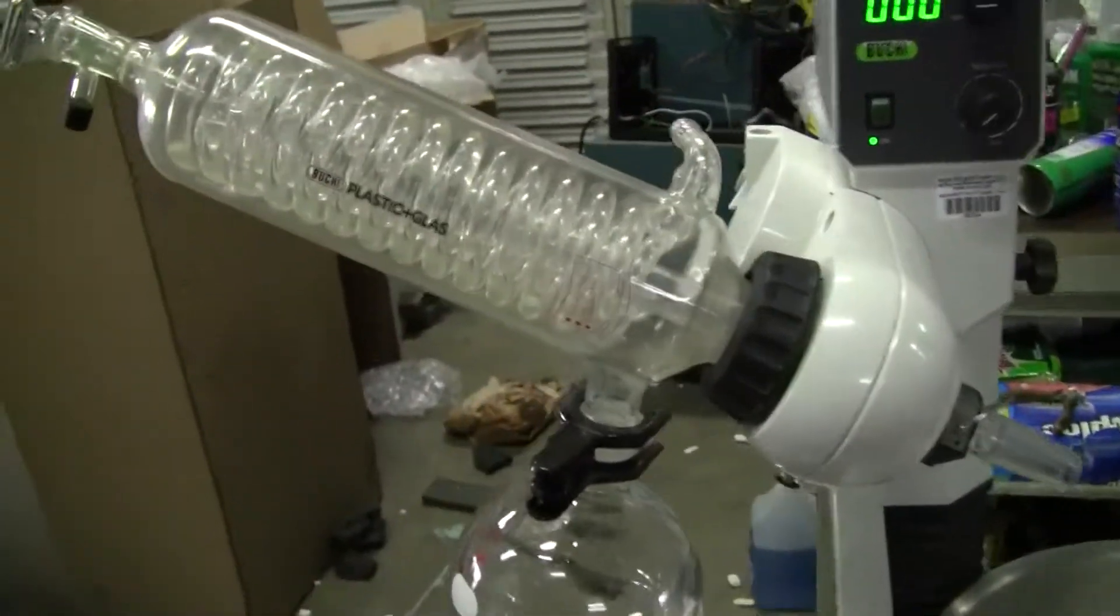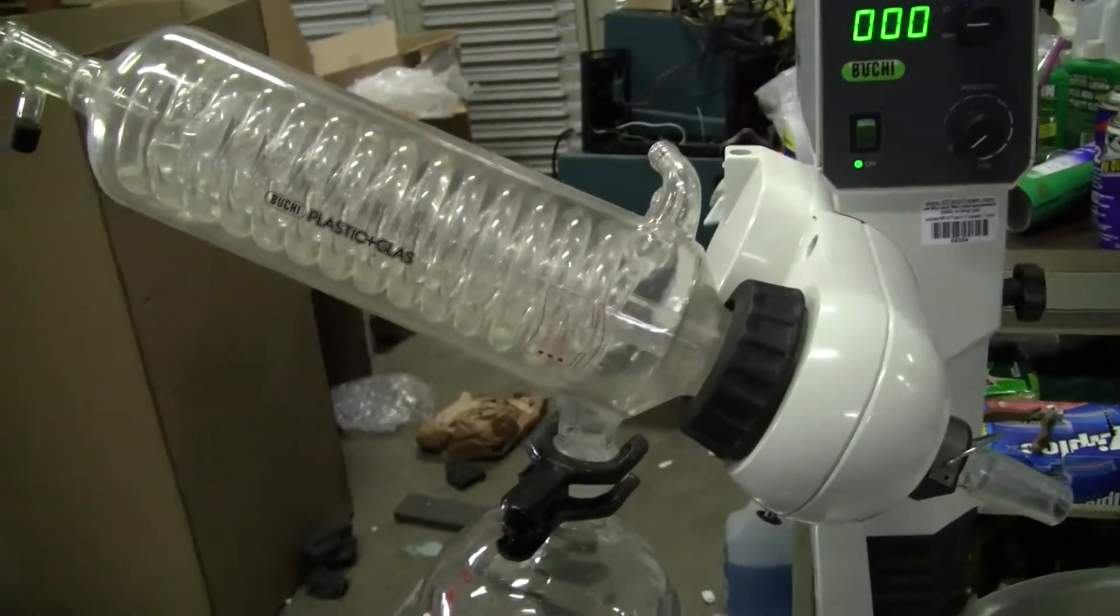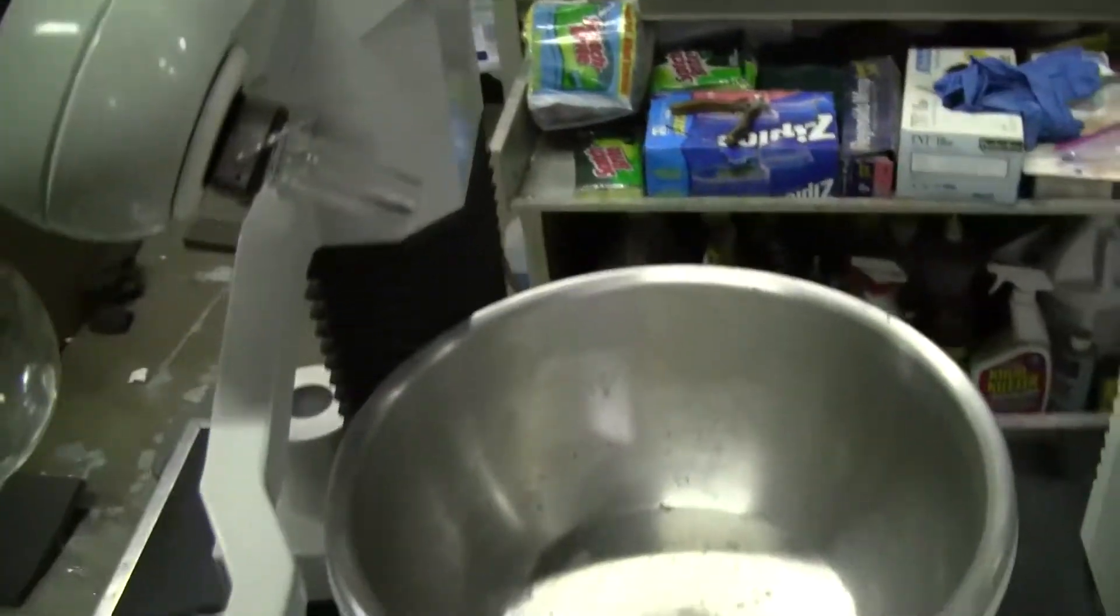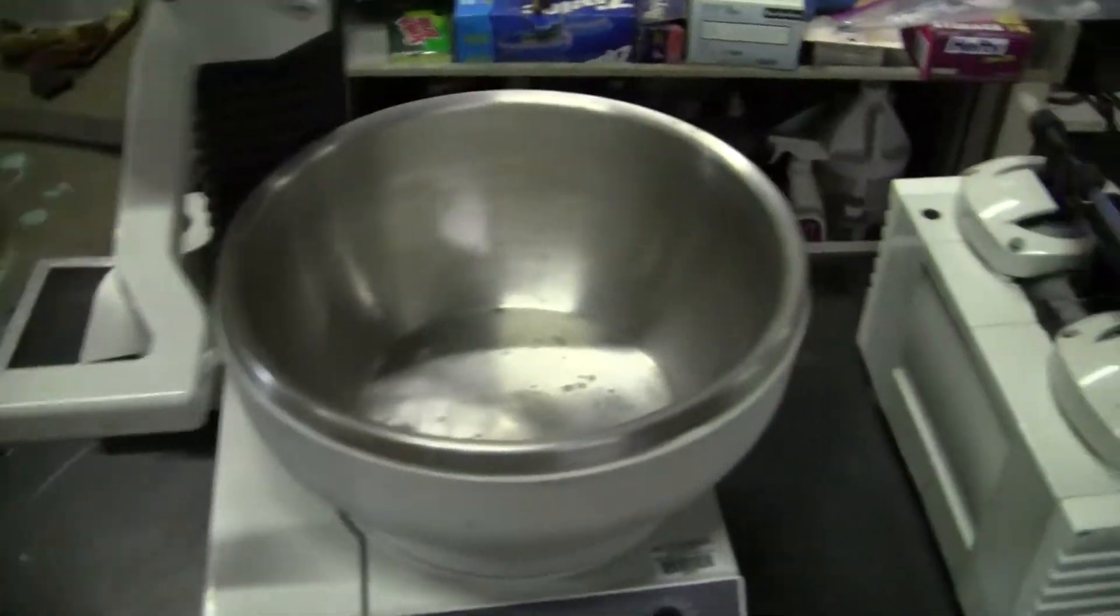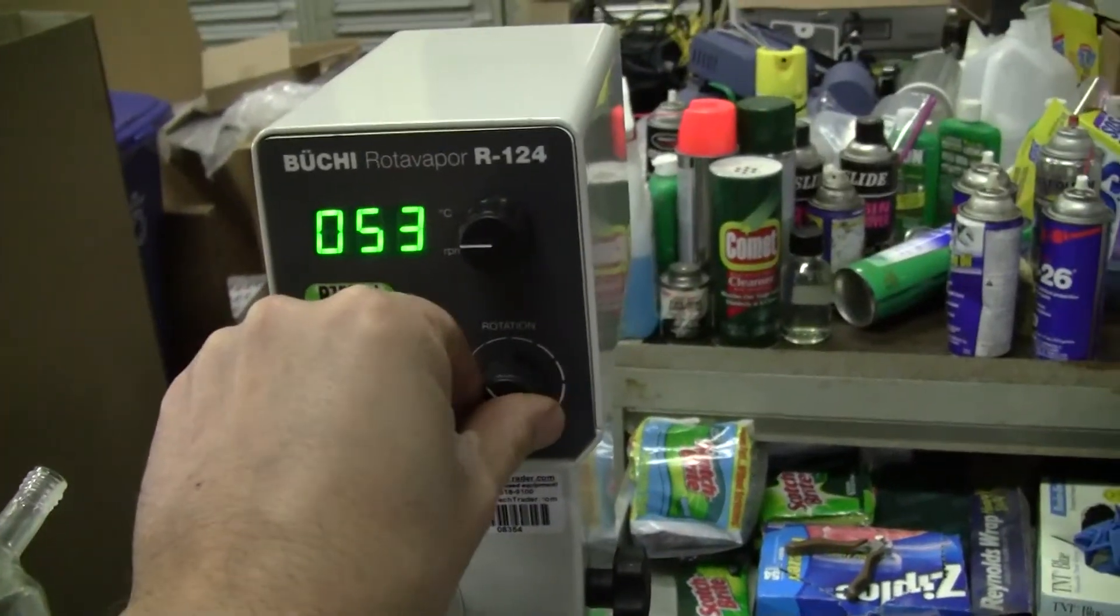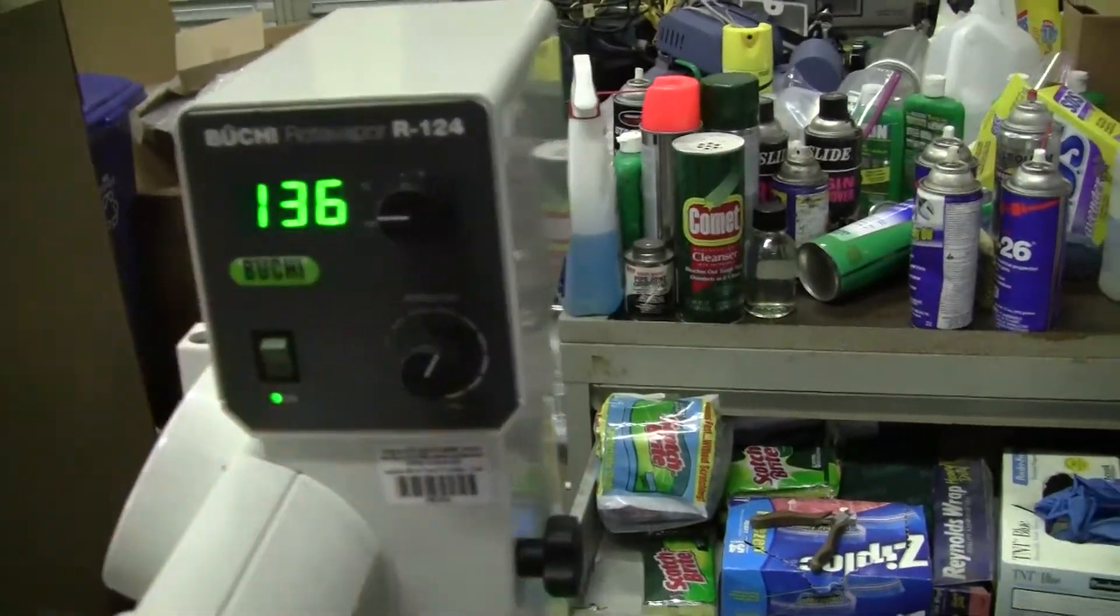It has a water condenser on it. It will come with another flask. We're just locating one for the purpose of this video. How it sounds rotationally - very clean.